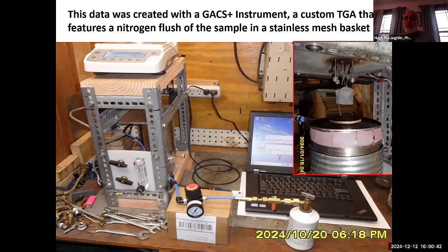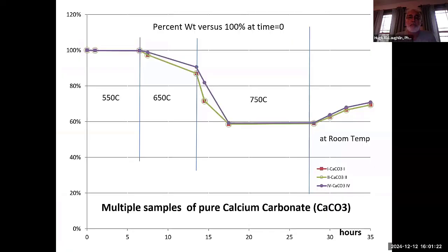One key feature of this custom TGA is the sweep gas going up through the sample, removing any desorbing volatiles or vapors. That's to prevent additional pyrolysis from making additional char, which wasn't there in your sample but might be there during your analysis. This is a problem with existing TGAs: they usually have covered or unflushed samples, and therefore you don't have good removal of the volatiles and you have secondary carbonization, etc.